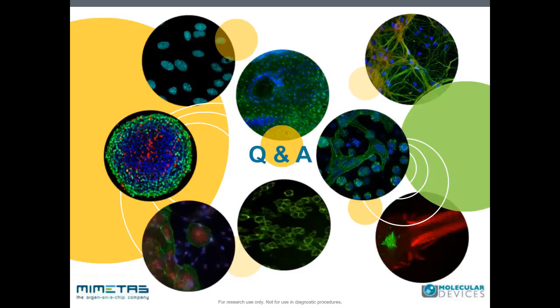Well, there's a couple of big differences. I think the first thing is that generally the speed of a high content reader like the ImageXpress is much faster than any of the open moving stage automated microscopes that we know of, which is a very important thing. The full operation of the machine is automatic, so also changing colors, etc.